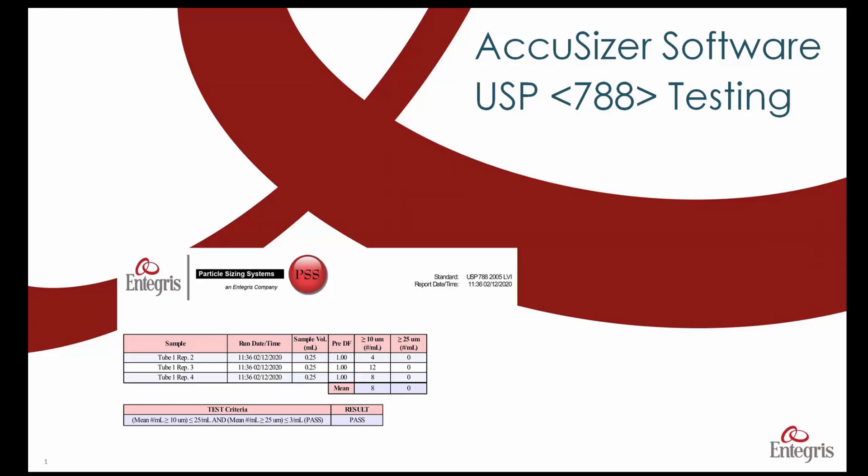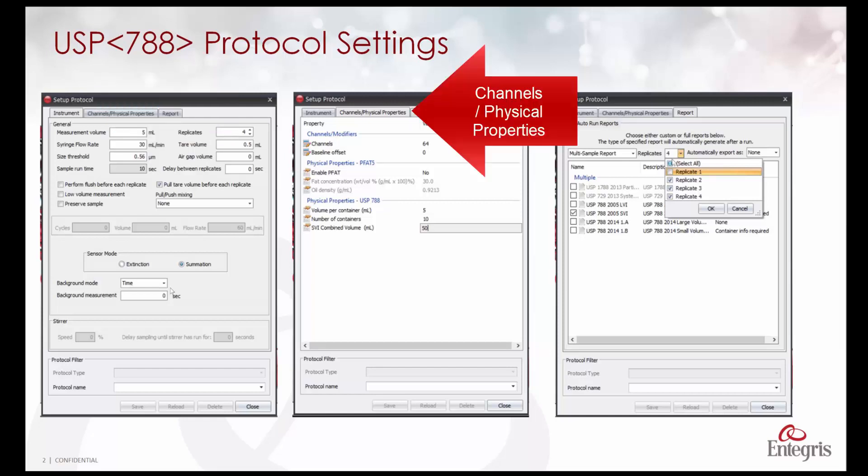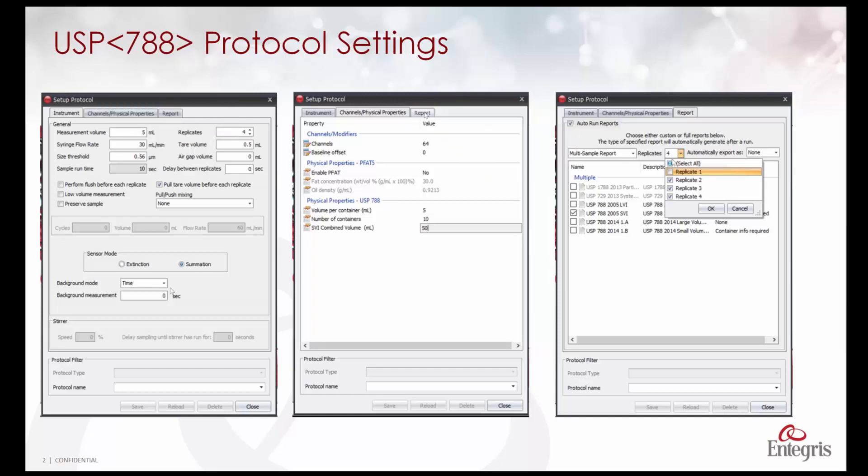This is AccuSizer software training on creating protocols when performing USP-788 tests. These are the three tabs used to create the protocol: instrument, channel/physical properties, and report.